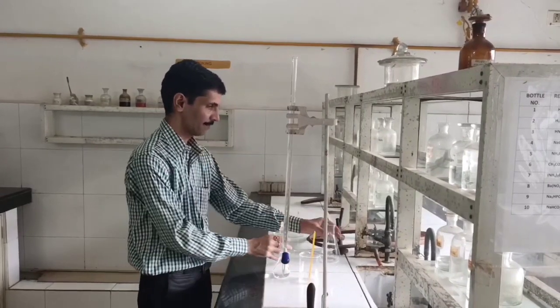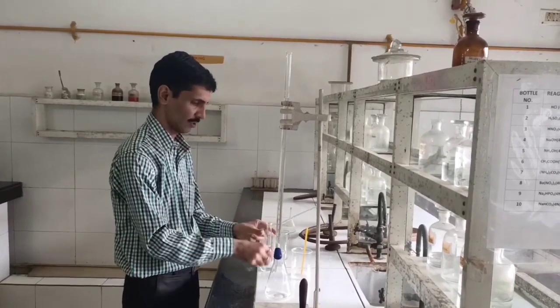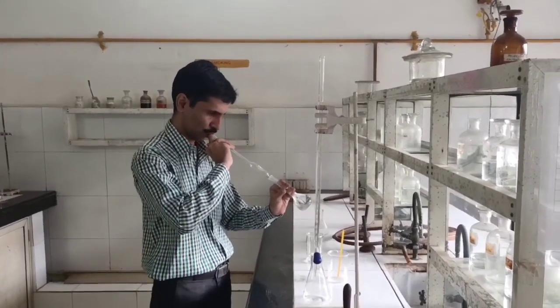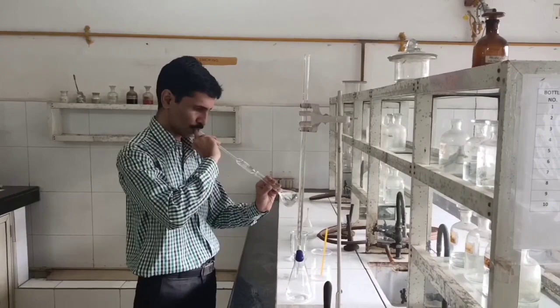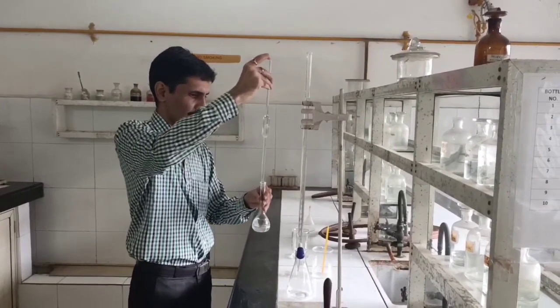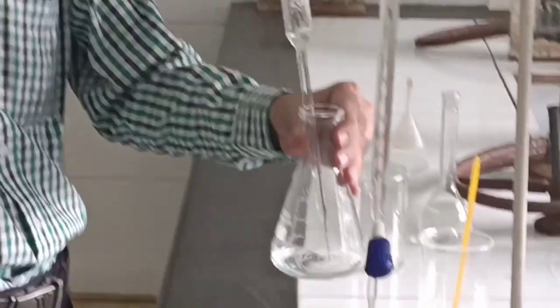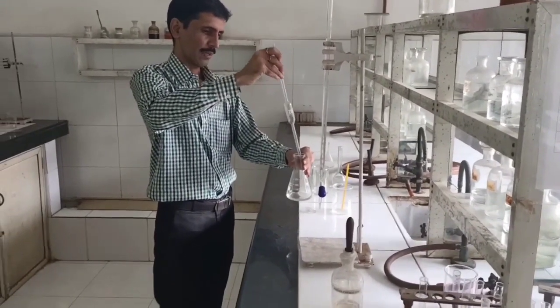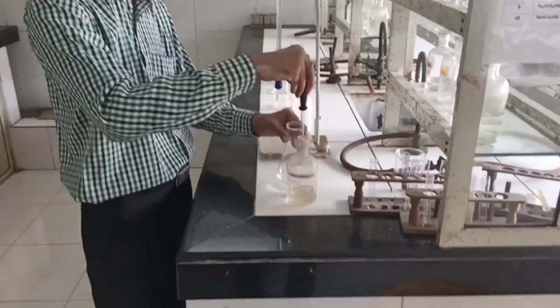Now, the next step: we are going to use a clean conical flask. We are going to take out 25 ml of the succinic acid solution which we have prepared right now. So this is exactly 25 ml. Into this, we are now going to add 2-3 drops of phenolphthalein indicator.